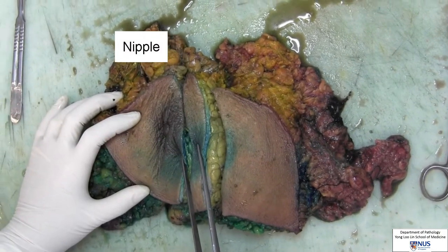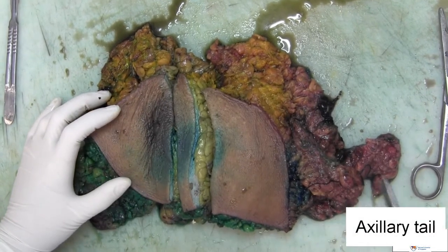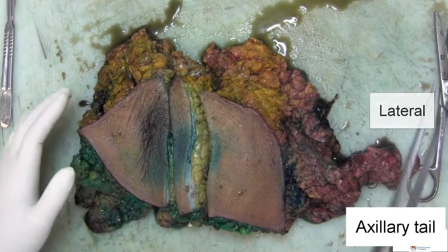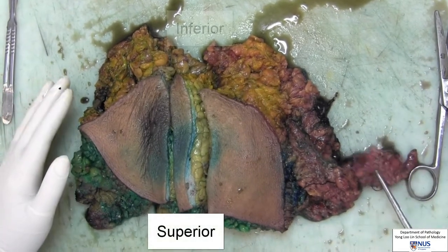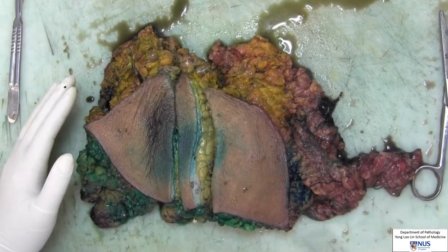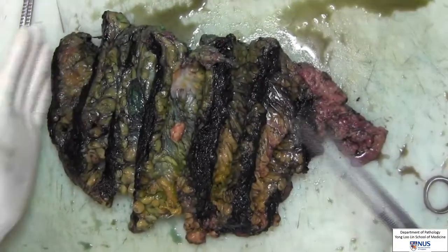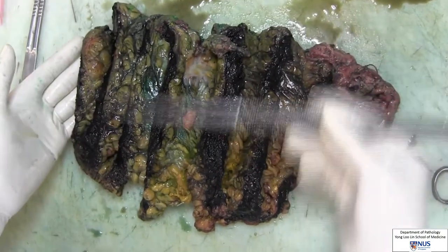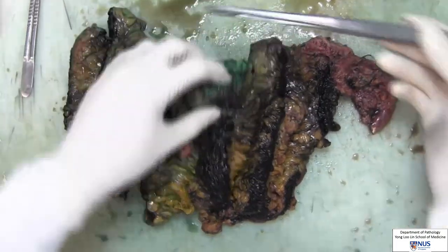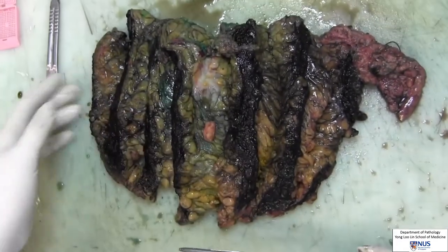Dye was previously injected to identify the sentinel lymph node. To orientate, this is the axillary tail, the lateral margin, the medial margin, the superior and inferior margin. We will now flip over the specimen to look at the posterior surface. The posterior margin is inked black, superior inked green, and inferior inked yellow.